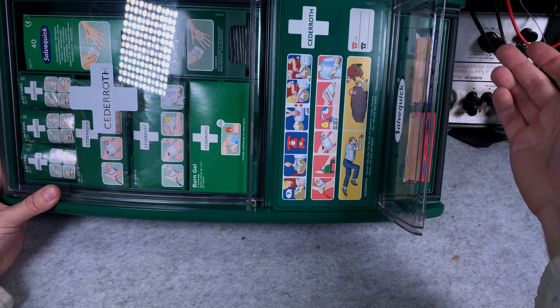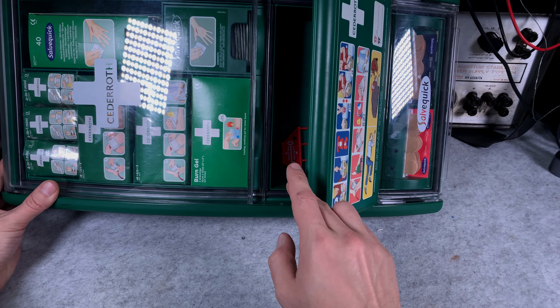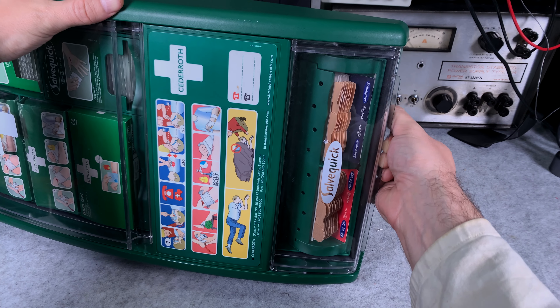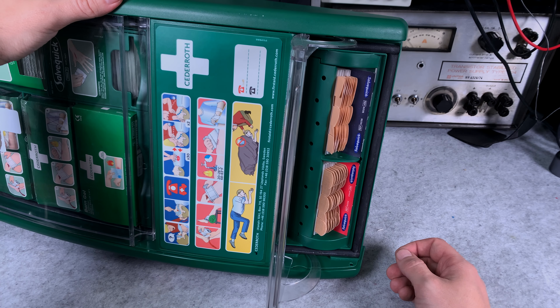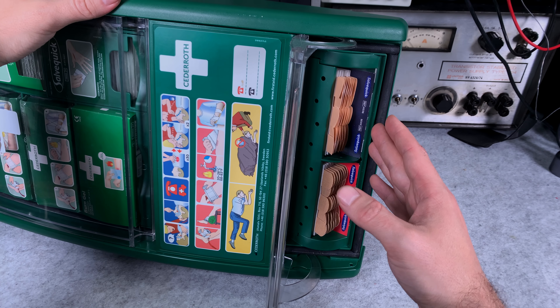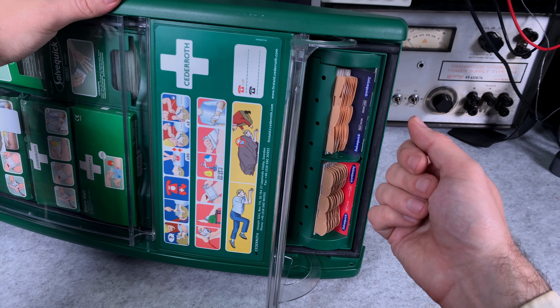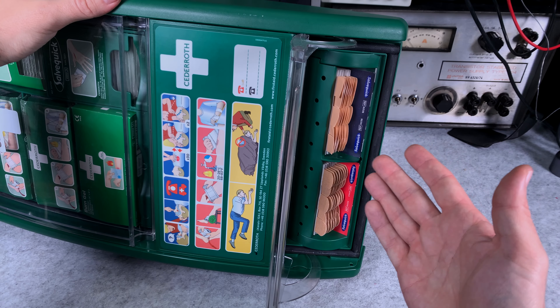There's another compartment here that is also protected with a seal. Most likely one of the most commonly used items is going to be just a band-aid for your finger, and it's got a dedicated compartment. As you can see we've got two different types of band-aids: you can use a waterproof regular one or a very specialized one for food processing plants — those have a metal insert so if someone loses one it's going to beep when metal scanning the food.